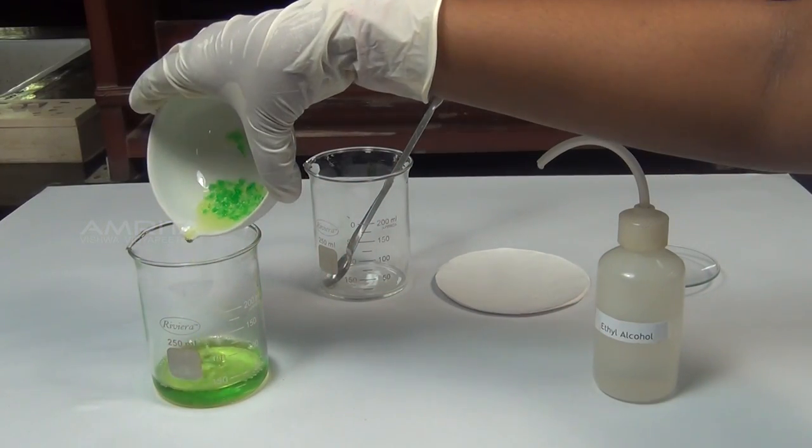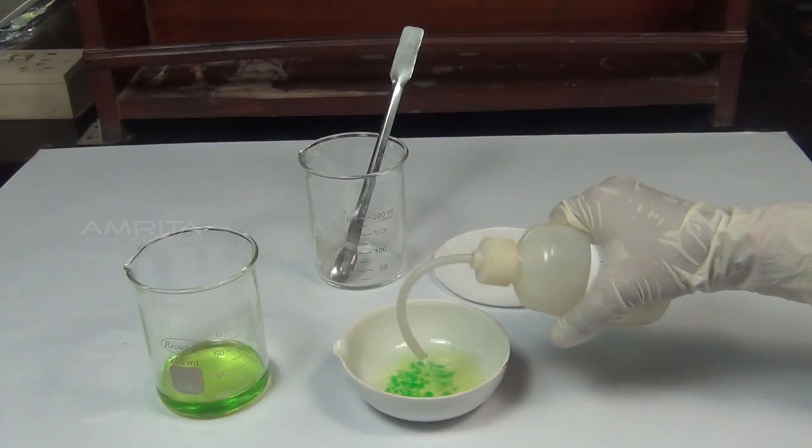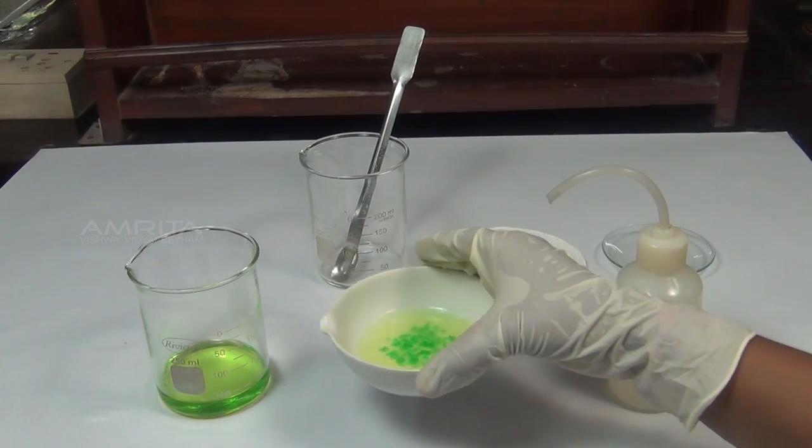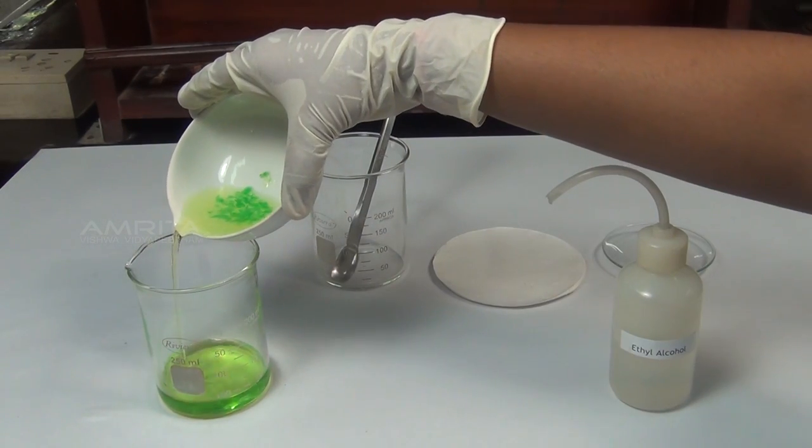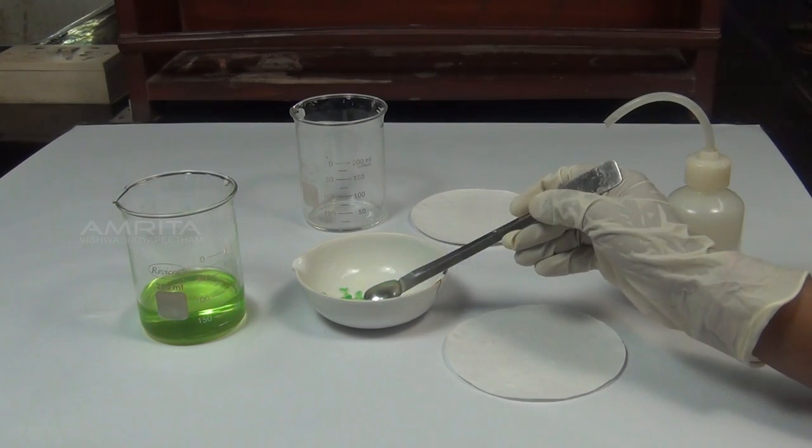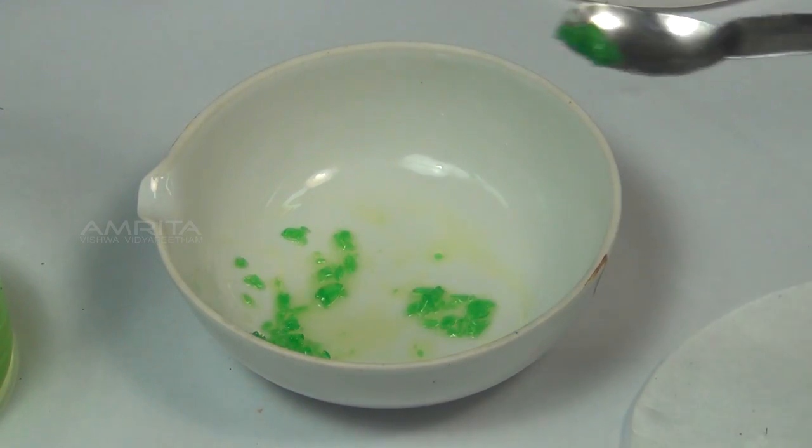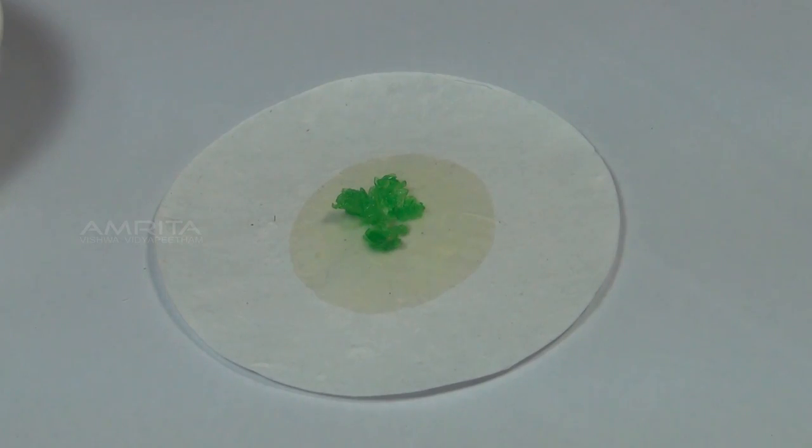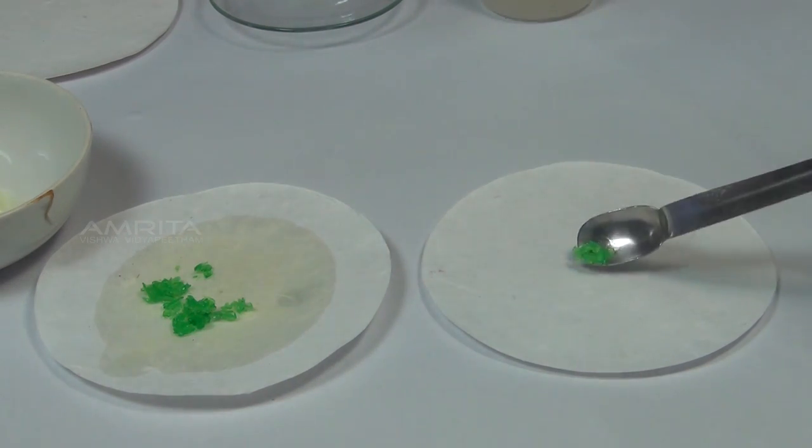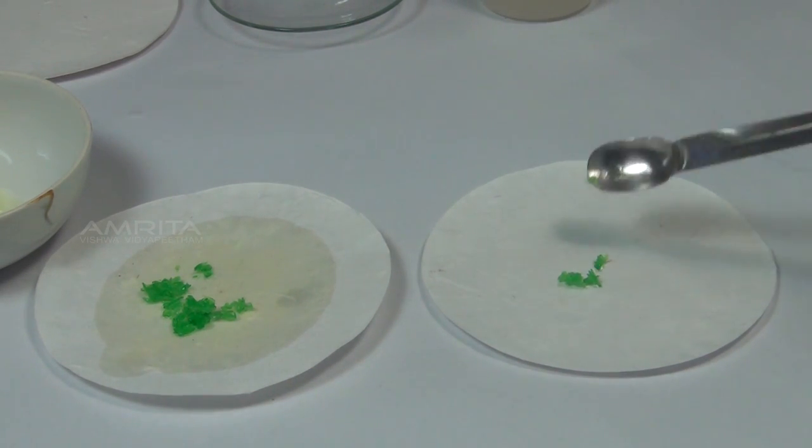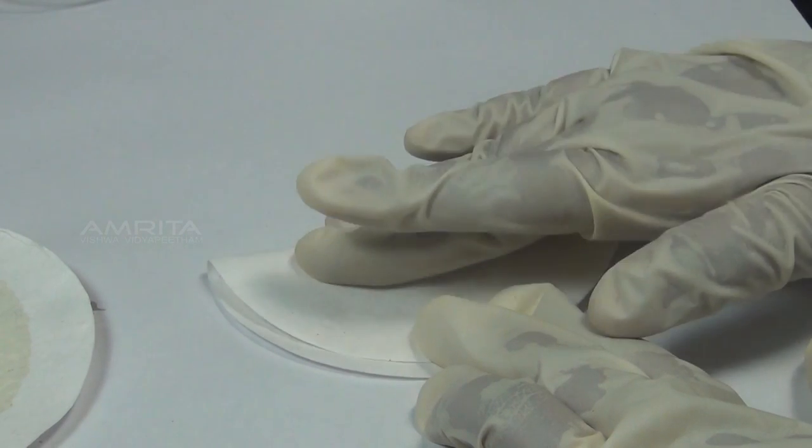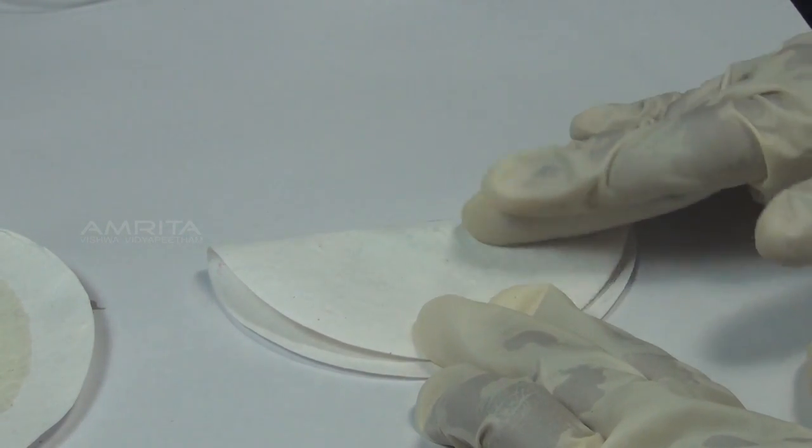Decant the mother liquor carefully into a beaker. Wash the crystals two or three times with small amount of ethyl alcohol. Using a spatula, remove the crystals to a filter paper which soaks up the solution. Transfer the crystals to another filter paper and dry them by pressing gently between the folds of the filter paper.